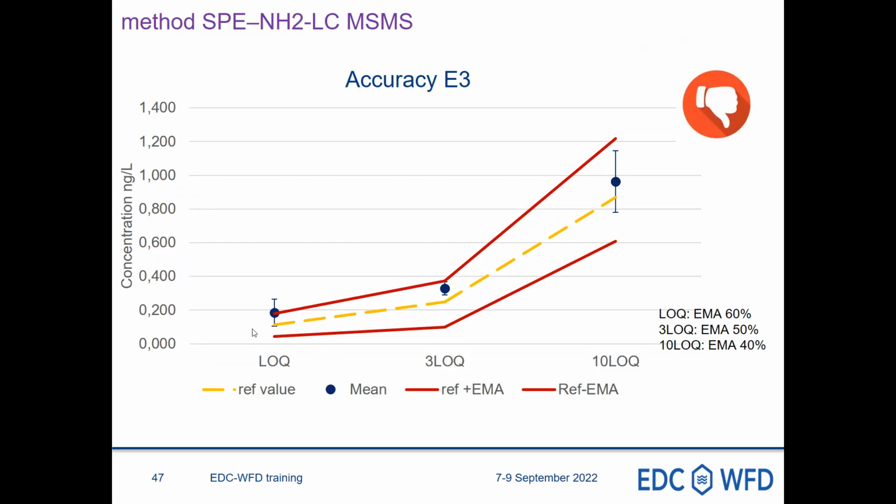It is linked to some interferences observed in some matrices and the lack of selectivities of some transition. So we come back to some previous discussion of today. This is really something critical and it should be considered. But nevertheless, even if this method is less performing at the LOQ, the performance at upper level are quite consistent.